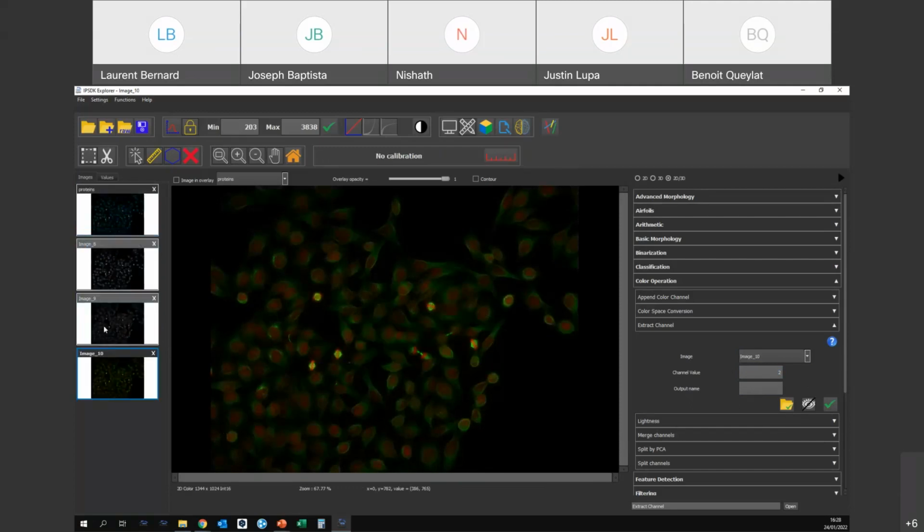That's really very interesting, and you can also create a multi-channel image from several channels. Just by highlighting the images, you can combine them. In that case, I just add 2 images. I can get only 2 channels.